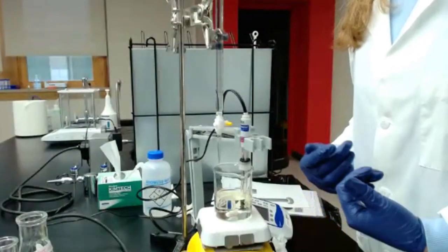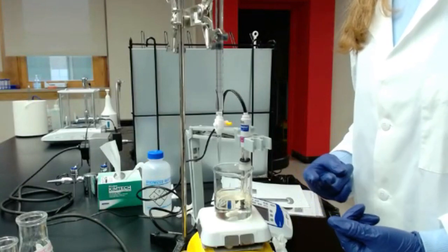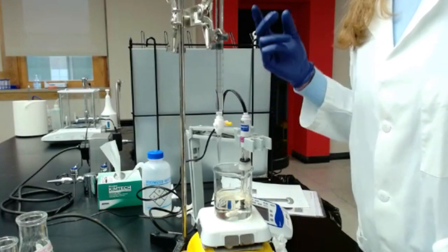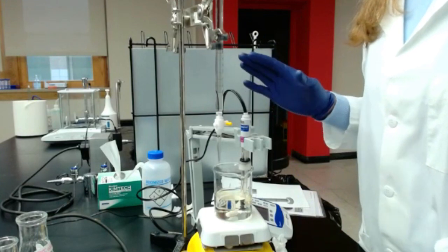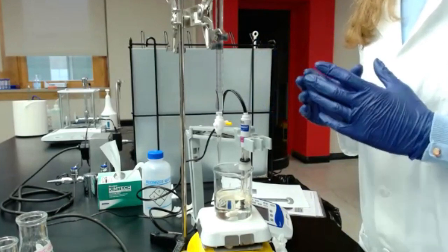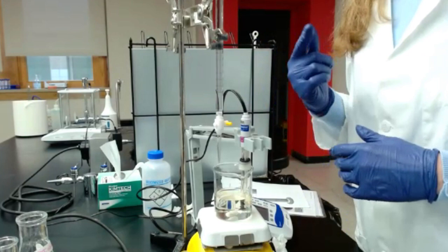I would say it's better to do that measurement at least 2 times, because you can have an error the first time you do it. So make sure you do 2 or 3 times the same analysis on the same juice. That way you can do an average afterwards and identify the representative value rather than just one measurement.